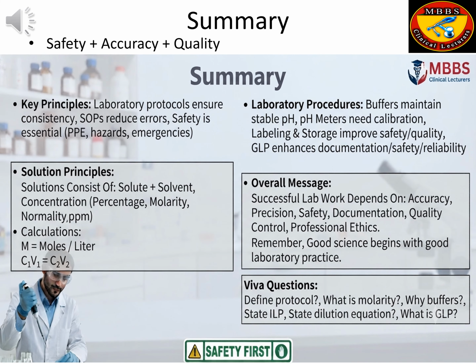Summary. In today's lecture, we covered the essential principles of laboratory protocols and solution preparation. Let's briefly review the major concepts. We learned that laboratory protocols are standardized written instructions that ensure experiments are performed consistently. Following SOPs reduces errors and improves reproducibility.